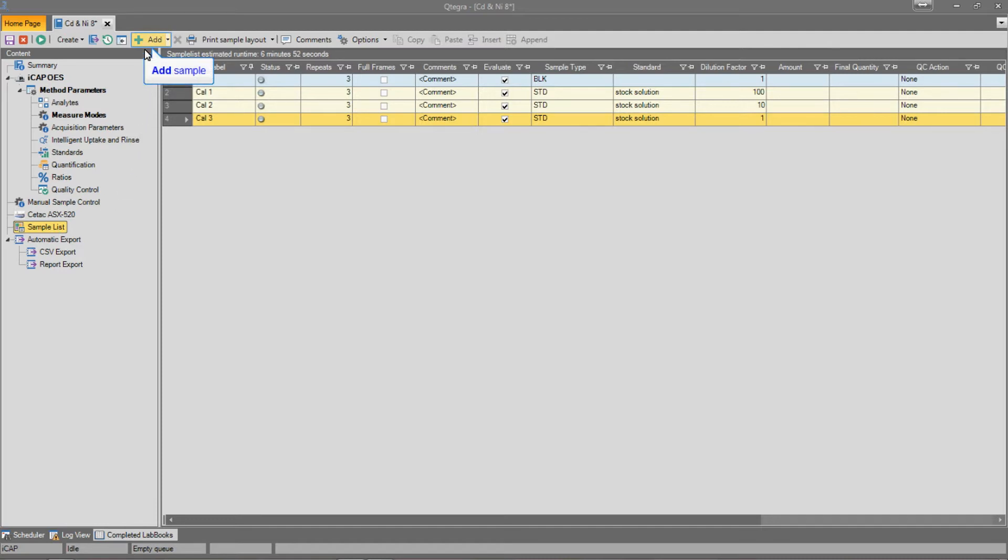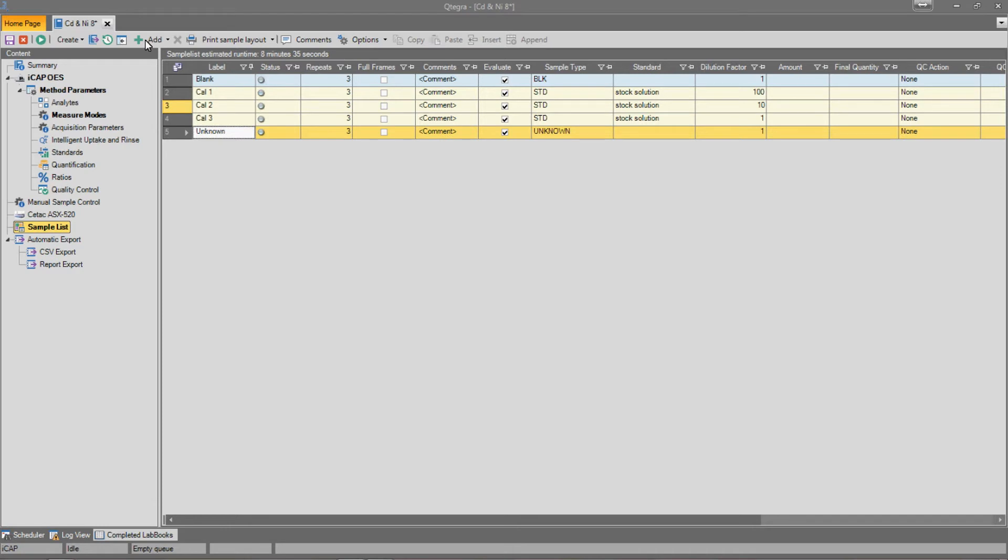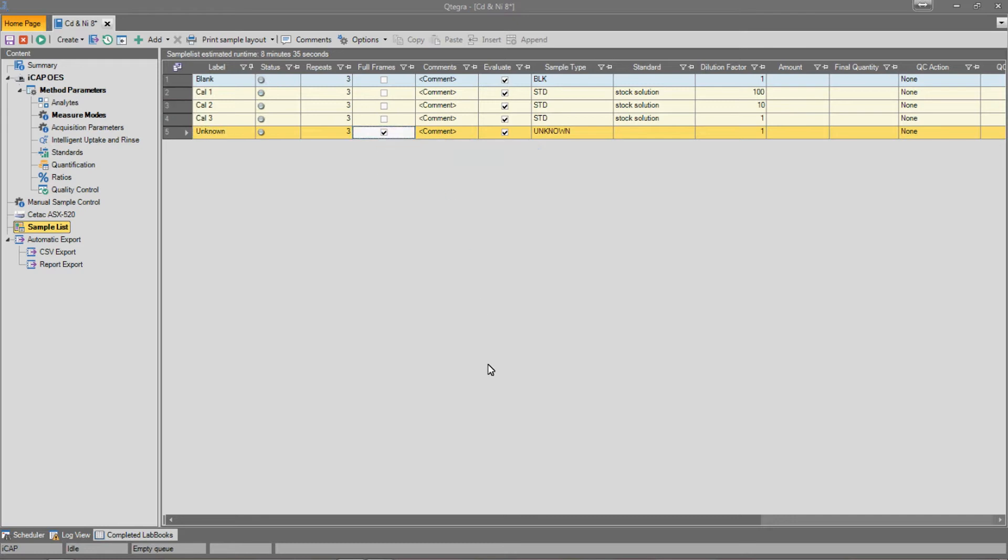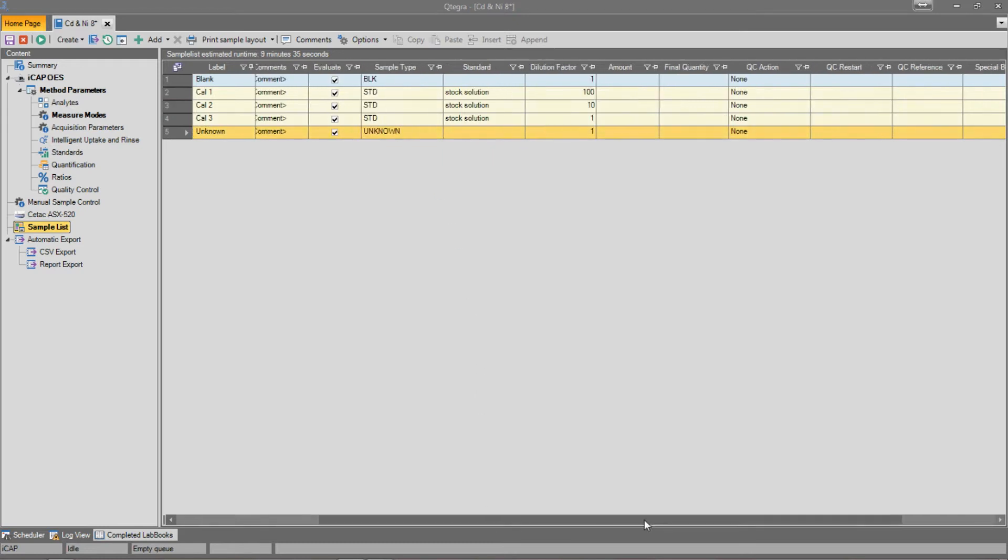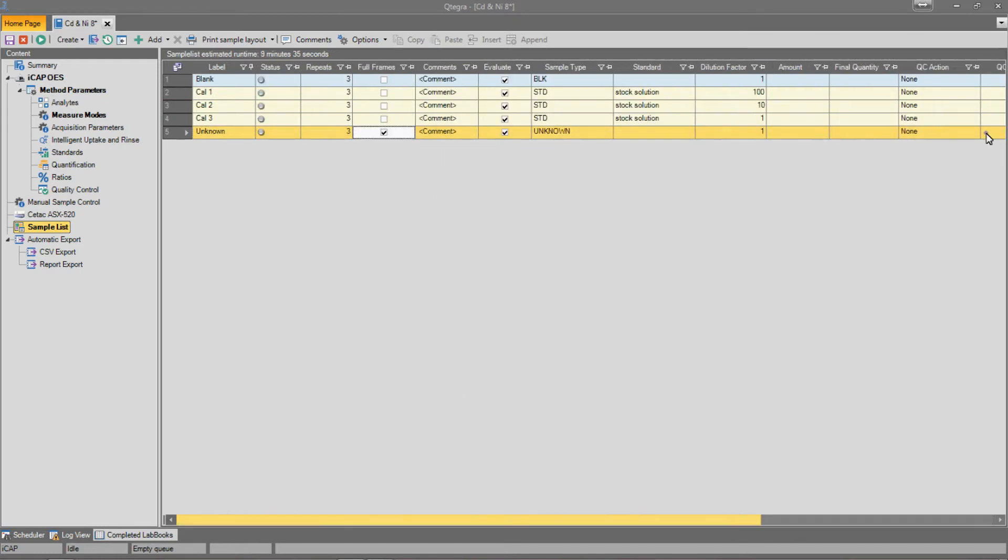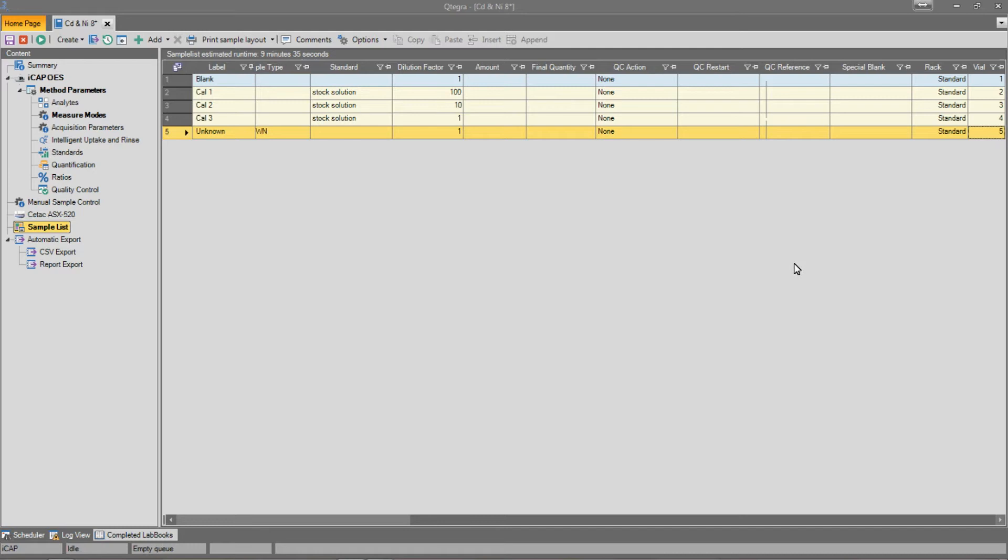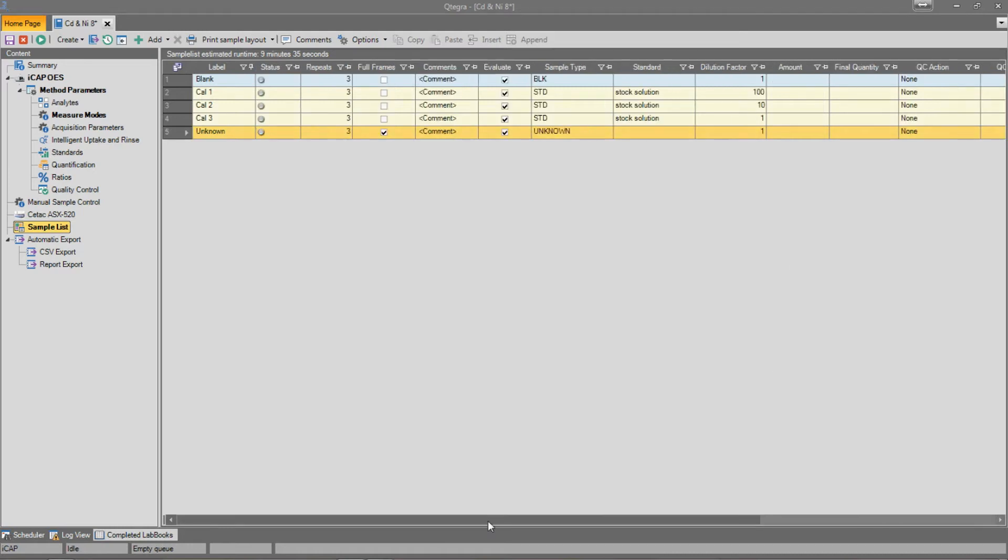So now we can create our sample list ready for analysis. Let's create a sample called Unknown. And then to activate the acquisition of full-frame images on this sample, simply click the full-frame tick box. And then we just assign auto-sampler positions to the samples.